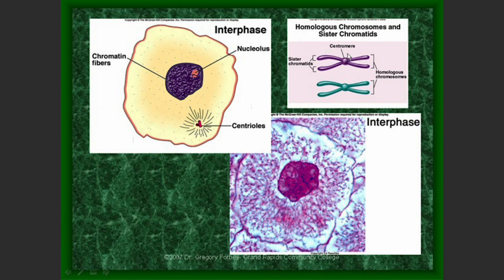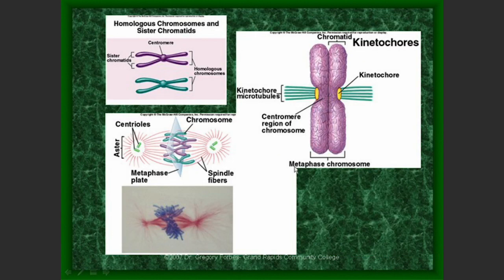As long as the chromosomes are attached to their replicate, we call them sister chromatids. And then later on, when they separate from each other, the whole purpose for mitosis, we'll call them chromosomes. So down here in this photograph, we can't actually see any of these because the sister chromatids haven't condensed yet. They won't cast a shadow. Let's take a look over here.